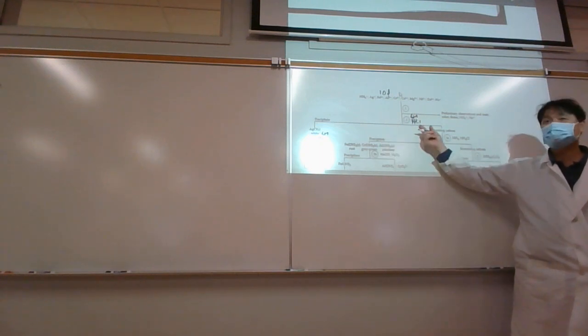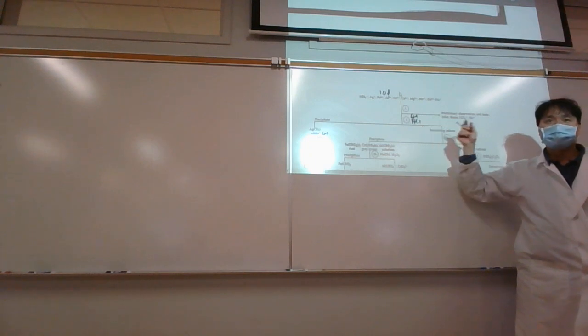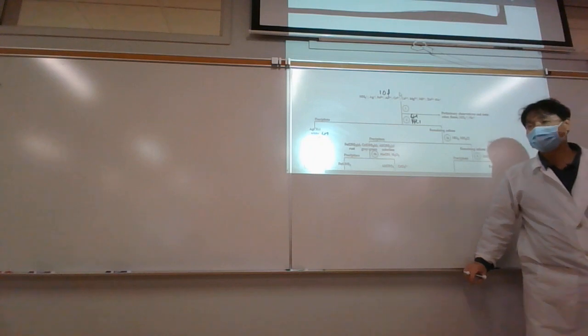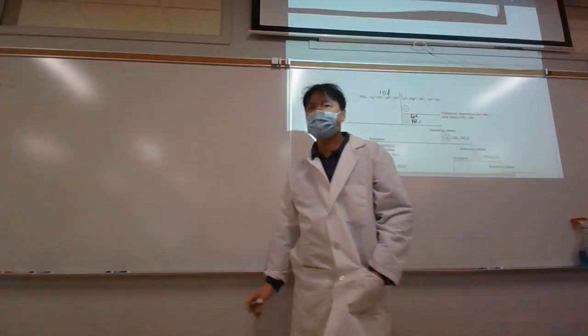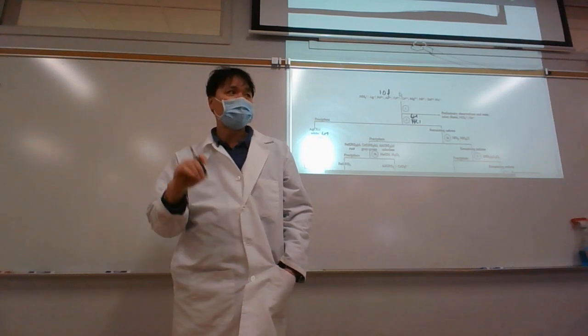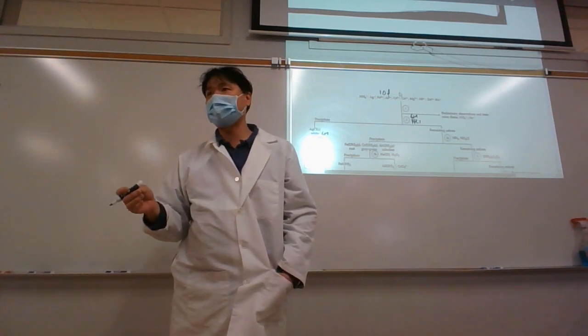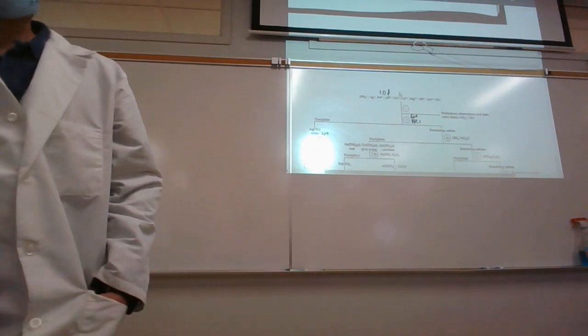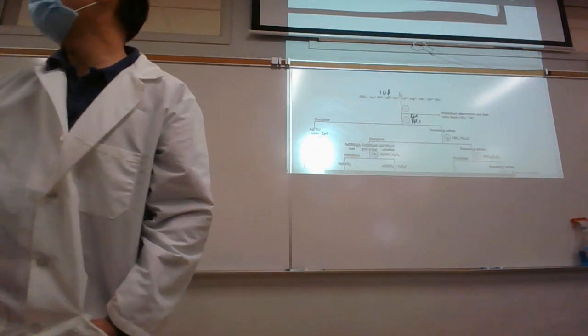Now, how much HCl do I add? I don't pay any attention to what the procedure says. I add as much as needed, and that's it. I don't add too much, and I don't add too little. How do you know how much is just the right amount?